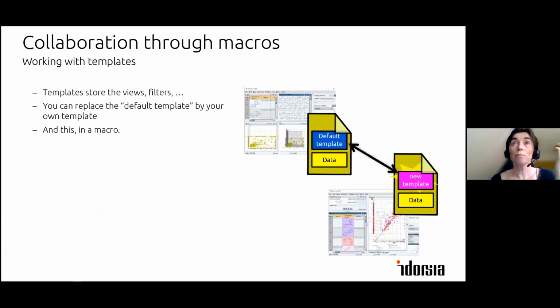As you have seen, the tasks of setting up the views, changing the colors, changing the size of the markers, etc. can be a very long list if you want to have, I don't know, 3, 4 views. So it's a bit cumbersome and it really inflates the size of the macro. There is another way to do that. The other way is to use templates.